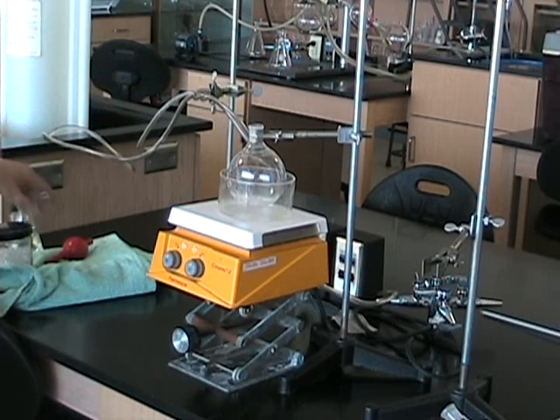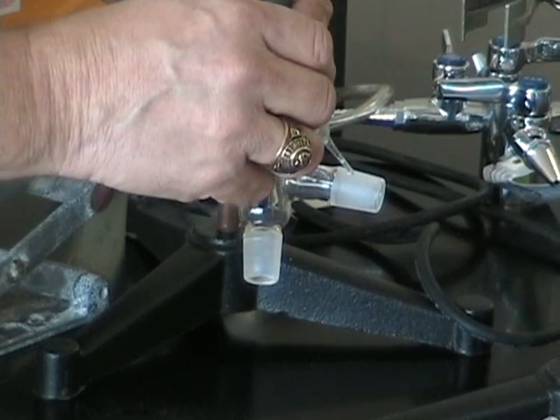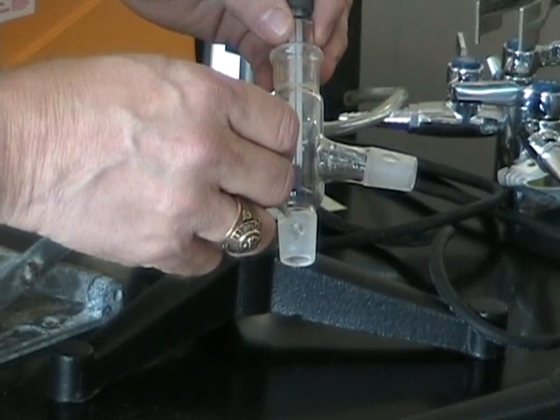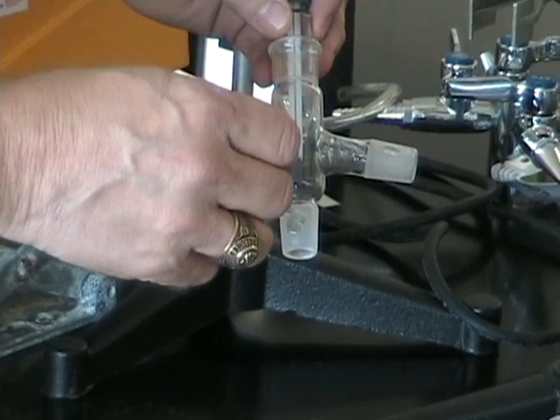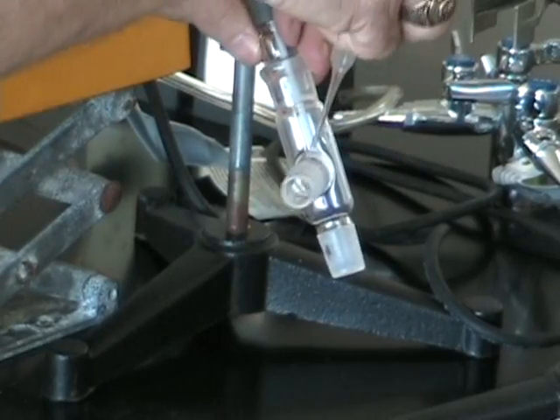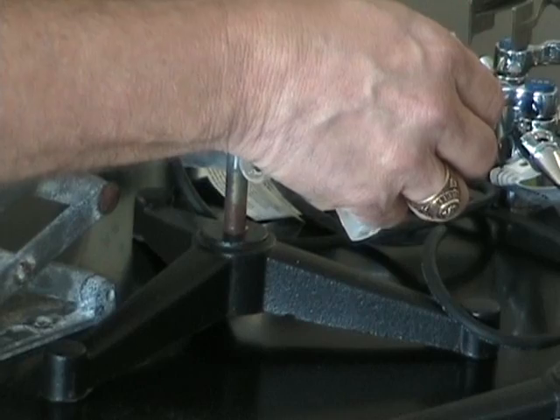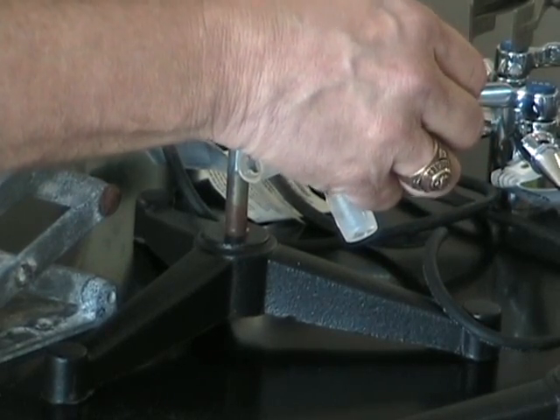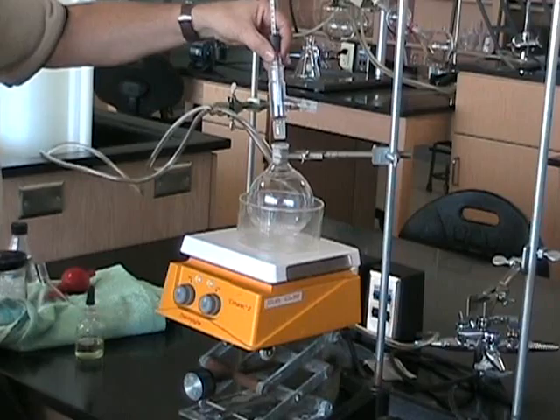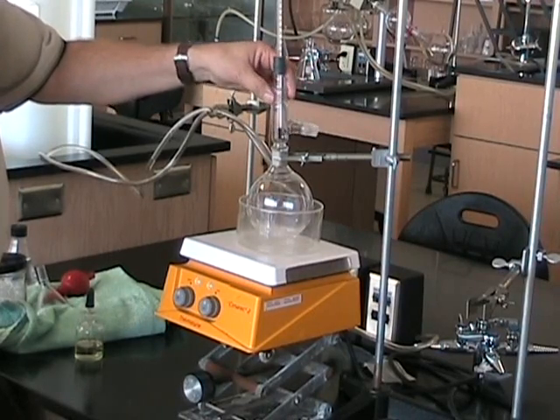We remove the funnel and there you have it. Put a couple of drops of seal oil on each of the joints so that when they go together we have a nice clear seal. Turn around the other way. Not only that Earl, but we need to be able to get them apart when we're finished. In we go. We're going to turn the apparatus so we have a nice clear seal.